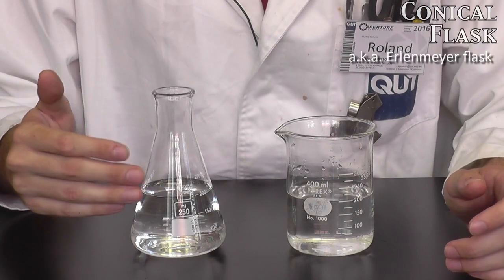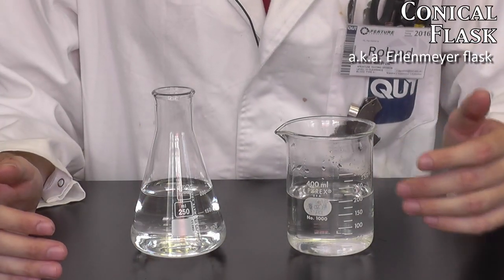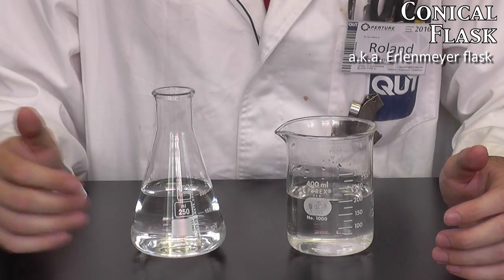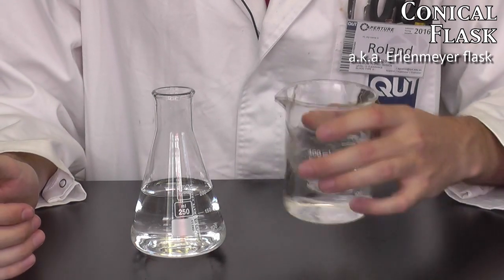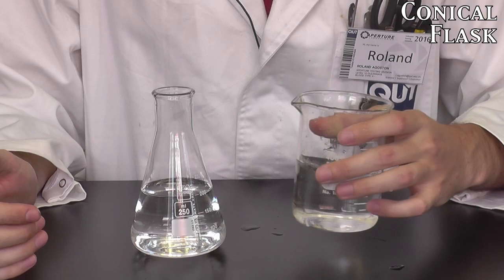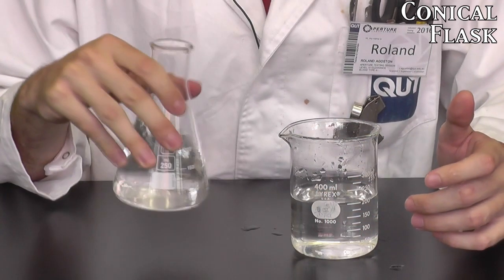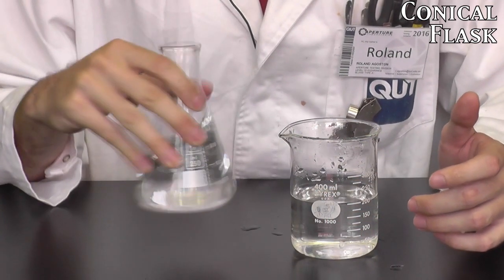Next up we have the conical flask. It serves essentially the same function as the beaker, but because of its shape it has some additional benefits. If I were to swirl the beaker a little too vigorously, it's quite easy to spill. However, swirling the conical flask, because of its shape, resists that same spillage.